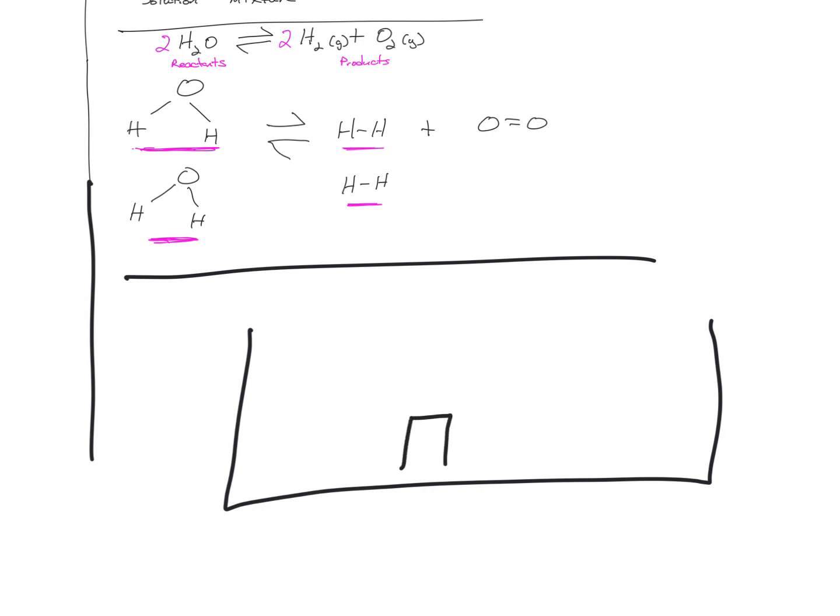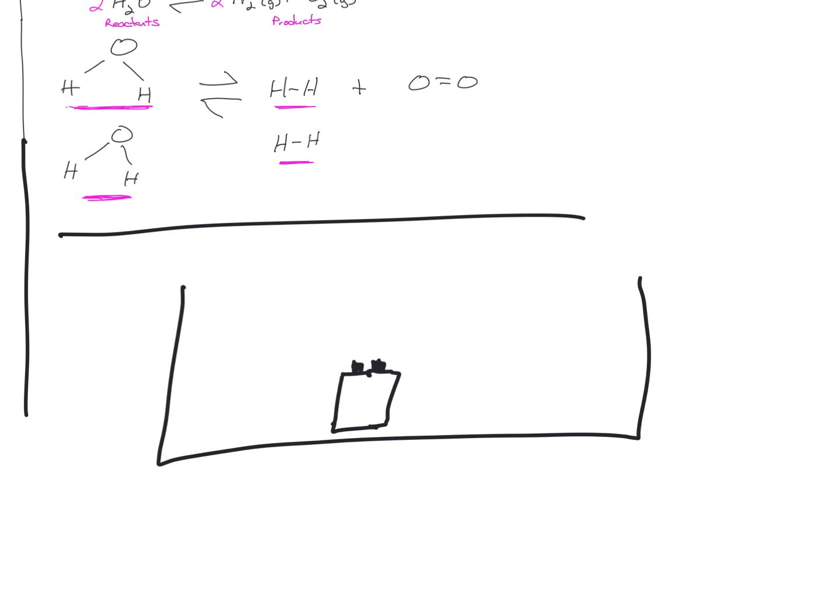It's a rectangular battery. The reason we're using a 9-volt battery is it has nice nibs that allow you to hold a test tube over it. And you'll see why we need a test tube in just a second. So these nibs are very important. And of course it's square, so it has a flat bottom, you can just sit it at the bottom of the water. You're going to hold the test tube over it like this. And another test tube is going to be over this one.